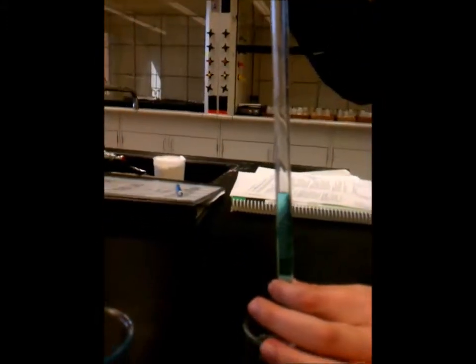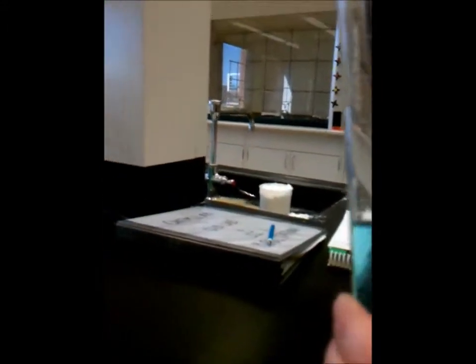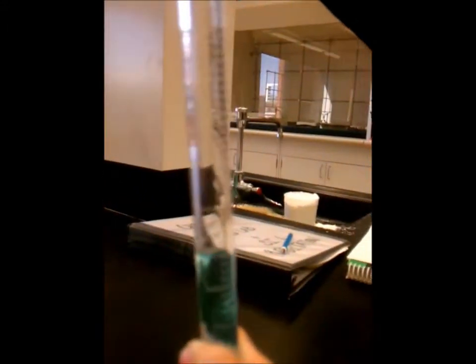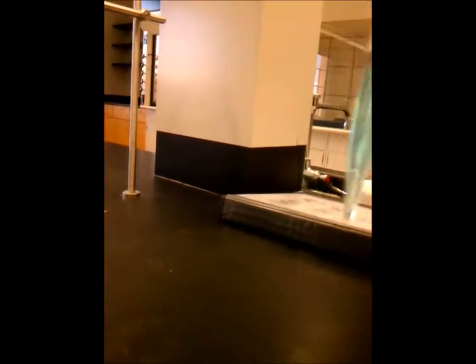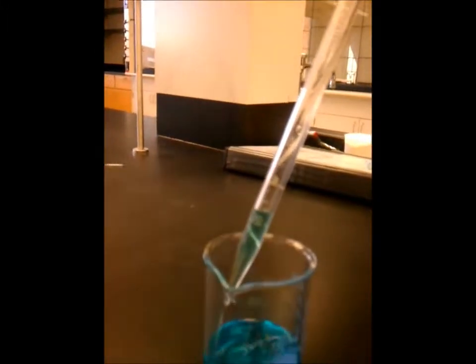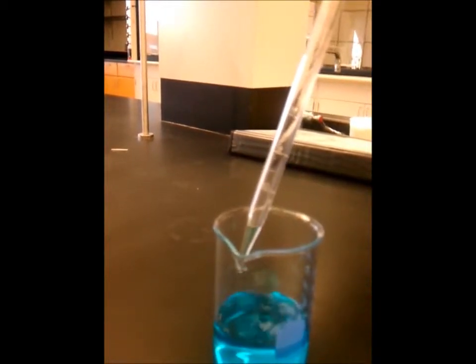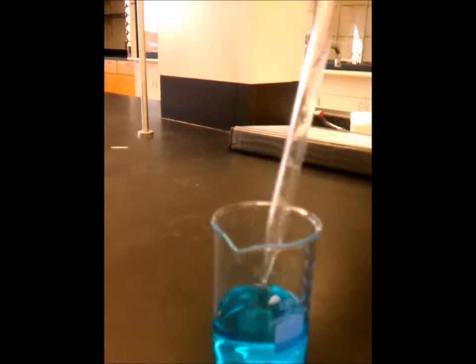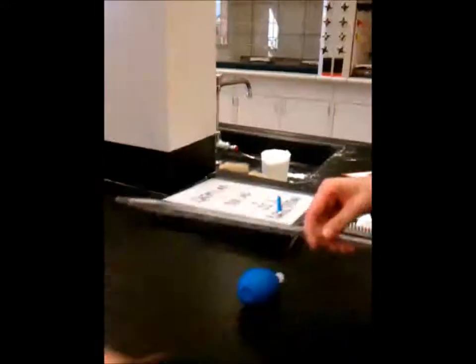So now I'm going to go ahead and try to drop it to 9. Alright. So I was able to get the meniscus down to 9.10. Okay. I'm going to return the rest of this to my waste beaker. Usually we don't put the solution back into the thing, but our TA said this time, since it's just blue water, this is appropriate. Okay?